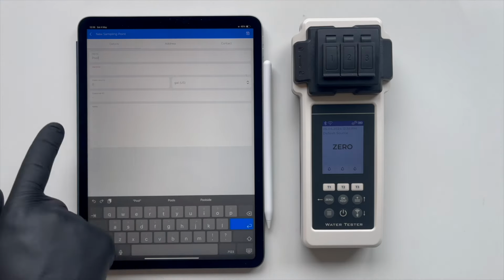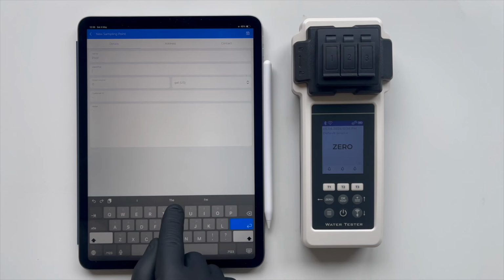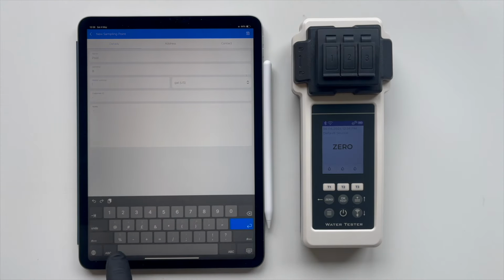For the identifier, we enter 8, since we already have up to 7 listed. Also, input the volume of this particular point or pool. Let's say, for example, 13,000 gallons.